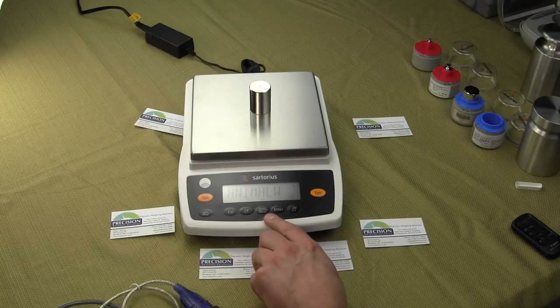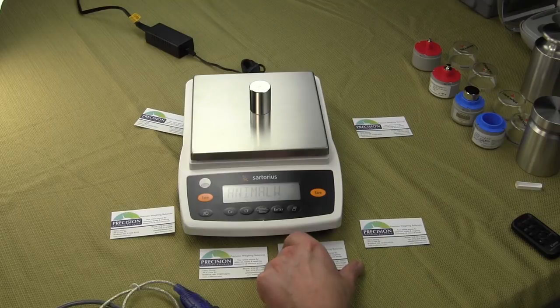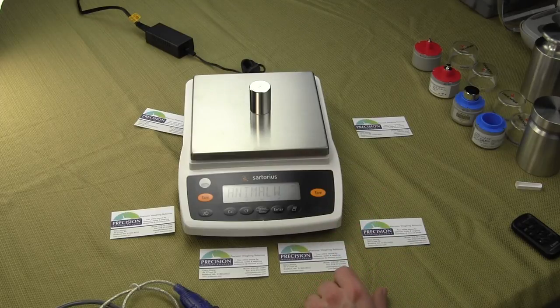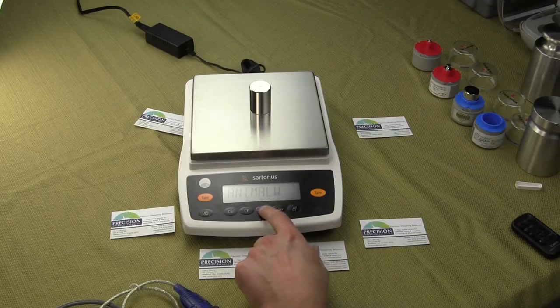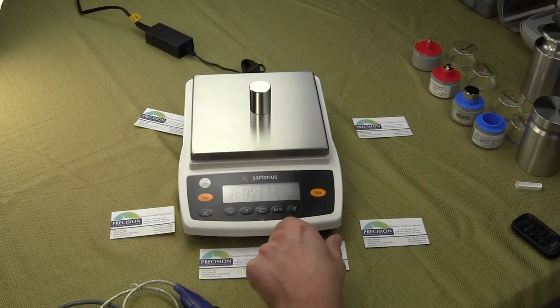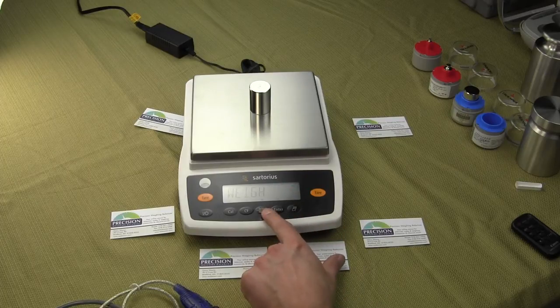We also have Animal Weigh mode. If in the laboratory you're weighing small animals — whether that be a mouse or some kind of insect — as they move around the platform, you can get readings that fluctuate. What the Animal Weigh mode does is it takes the average weight. And then we have Density — if you wanted to do density determination using that underhook. And then back to the standard weigh mode.